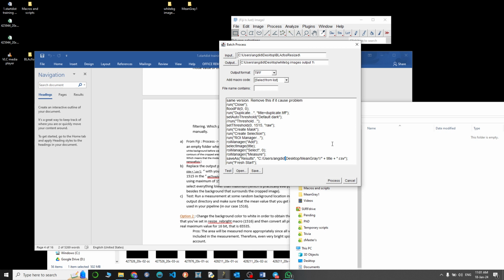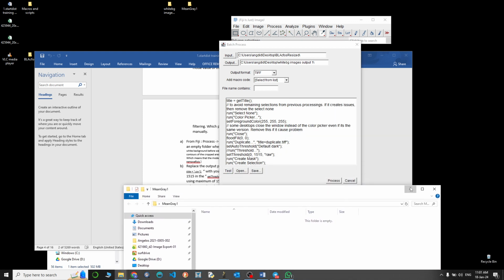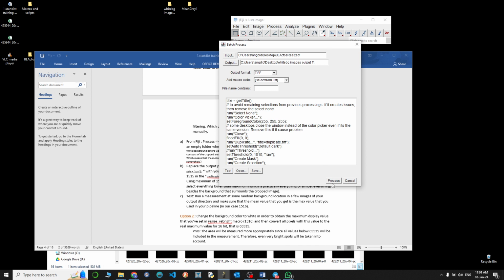You will have to experiment a bit if you're using Mac. And in case you get any title warnings, any title errors, that is errors related to the name of the image, then you might actually have to change the name of your image, but we will probably come across that in the future.